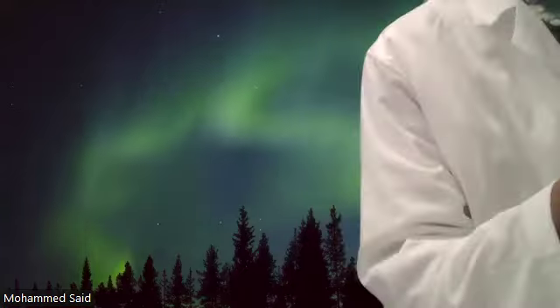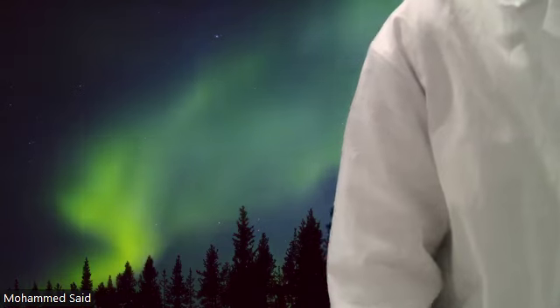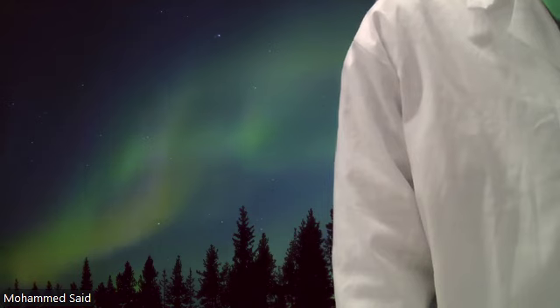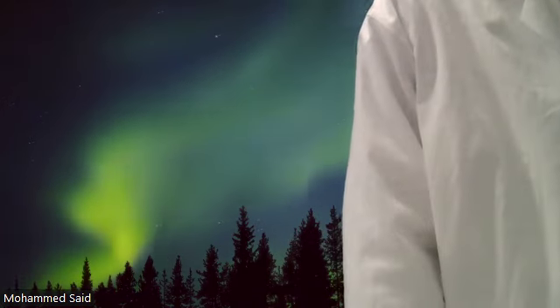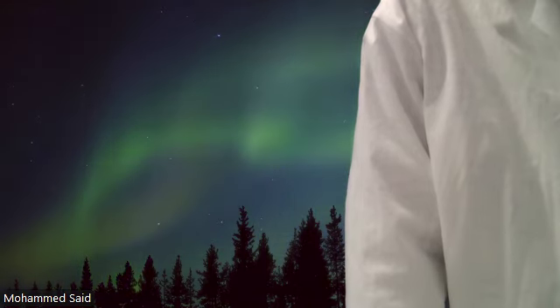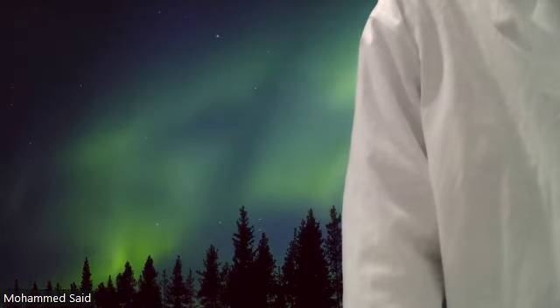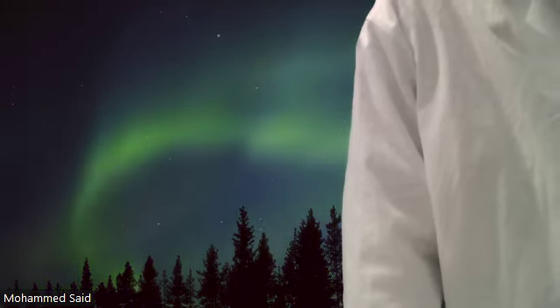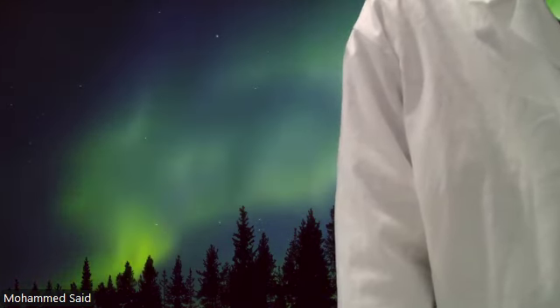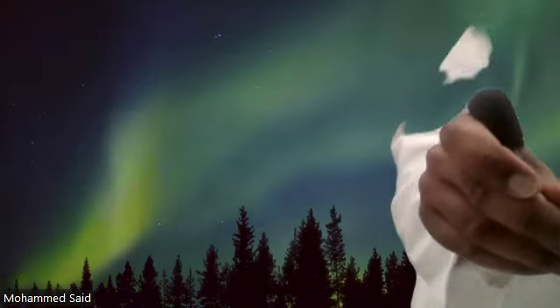Now, everyone, I'm going to start asking the numbers for your bacteria. In terms of timing, I also need us to catch up a bit, because we have a few stains that we need to go forward with. I see some people have done the capsule stain already, and some of you look like you're preparing for the gram stain, which is good.